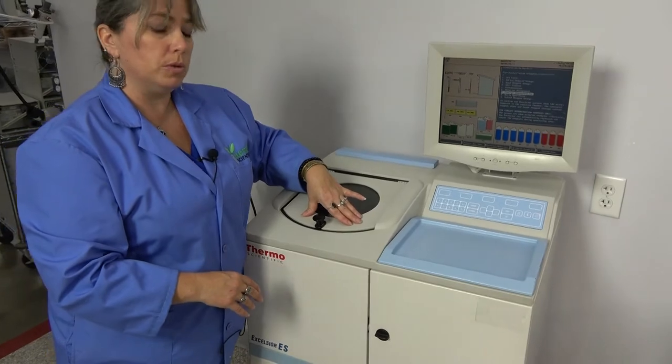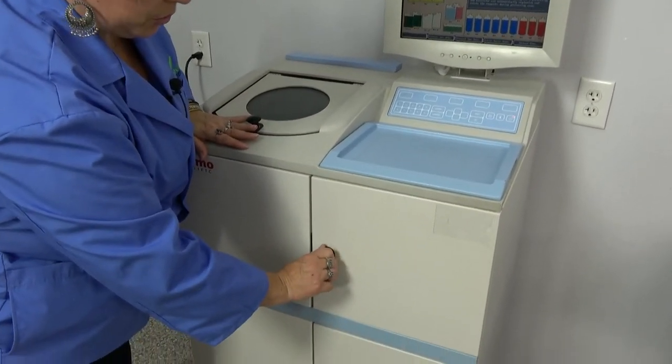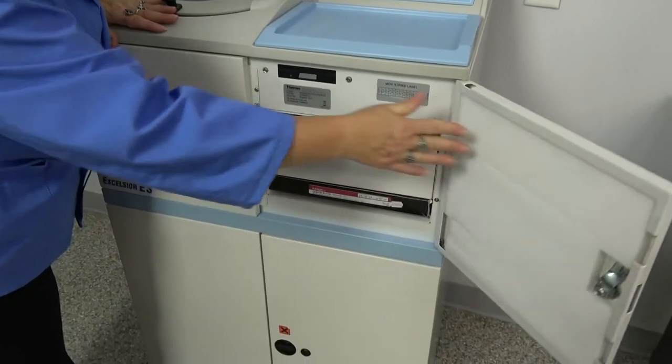When those fumes are pulled away from the user's face, they then are filtered through the air filters which are housed here.